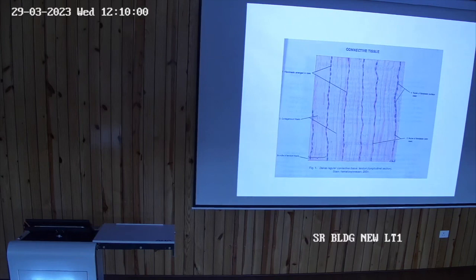In the last class, when you were seeing the slides of tendon and ligaments, I also showed you the slide which is in focus now. That is the LS, longitudinal section, of the tendon. See the diagram. It consists of collagen fibers. All these are collagen fibers. In between the bundles of collagen fibers you see the flattened nuclei. Okay.